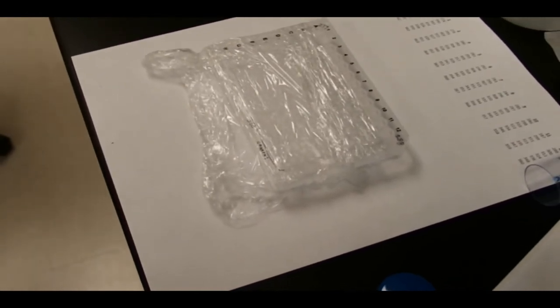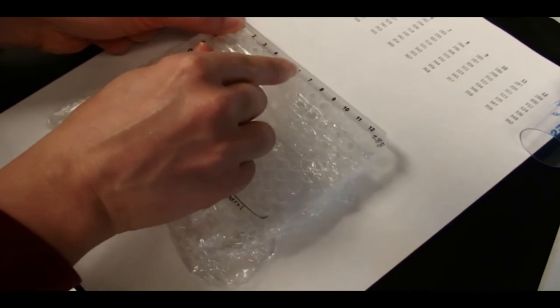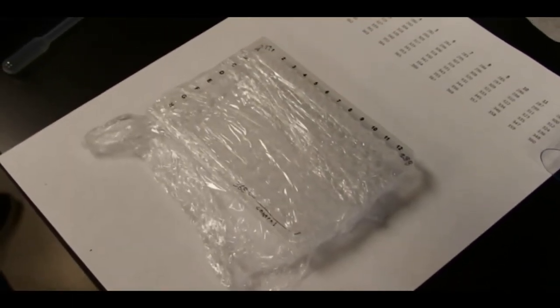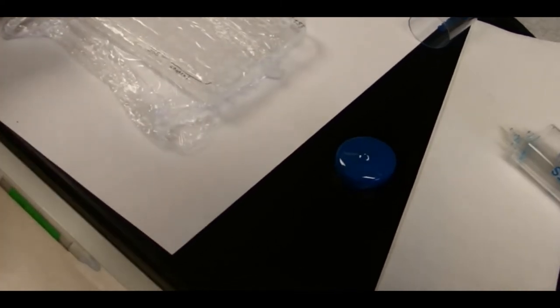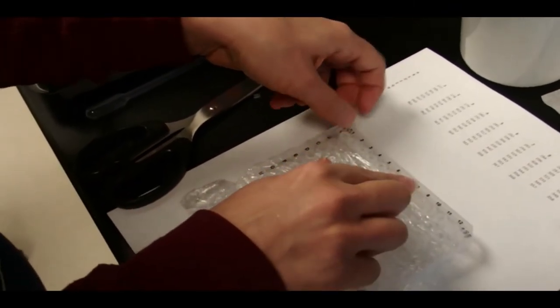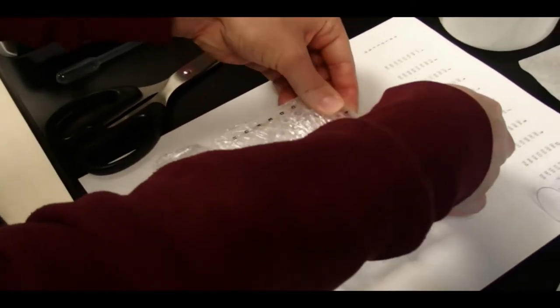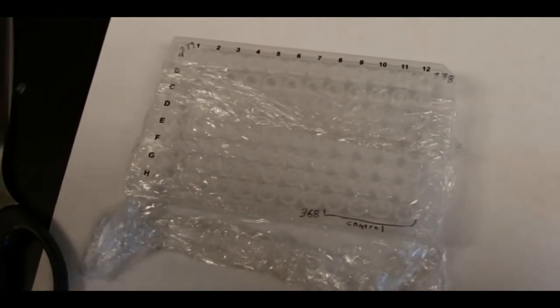And we are going to use strip caps that are 12. We don't have them right at the moment, so we're going to improvise with 8s. But we have the 12 ones coming in the order. You need scissors? Do you have scissors? Again, it doesn't matter to be sterile or anything like that. It might not work very well, but yeah, I'm going to have to cut off that end. Again, we're improvising with the 8 strips that we have right now. We'll have 12 strips later. And so now you'll easily know that you have finished the first row, and now it'll be time to peel back the plastic wrap to the next row and continue.